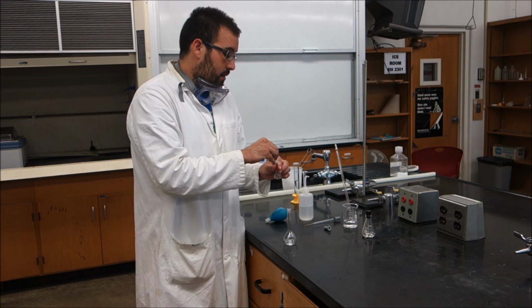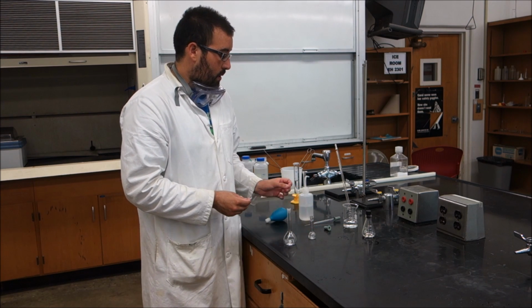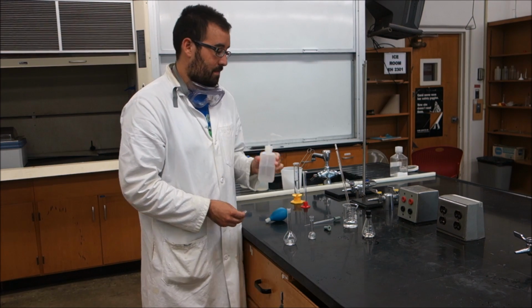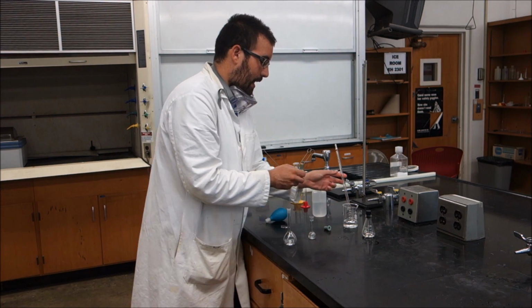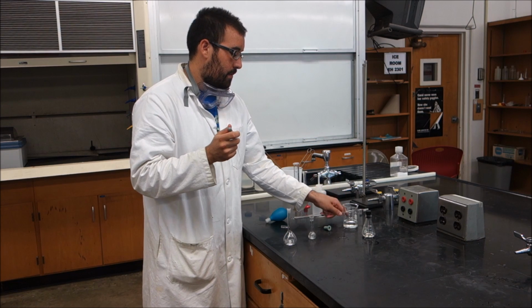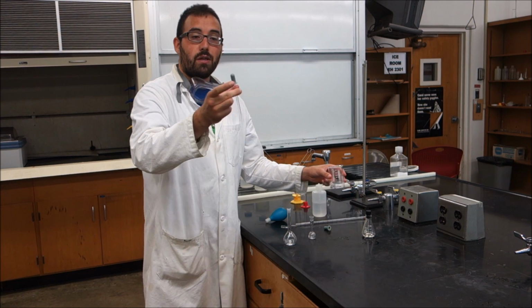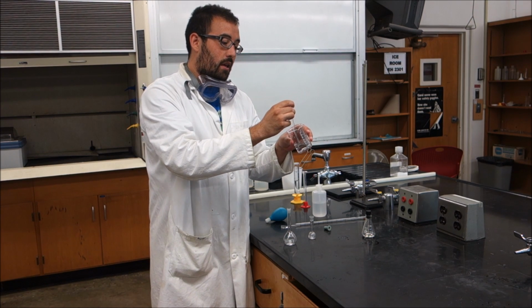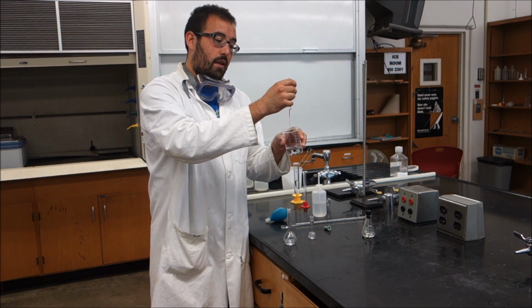Now, the other thing that you can do if you don't want to use your little squirt bottle, again, don't do this, this is bad. You can use a Pasteur pipette. Now a Pasteur pipette works by putting a little Pasteur pipette bulb up the top, inserting it into your liquid, so in this case it's water, and then bringing it back up.